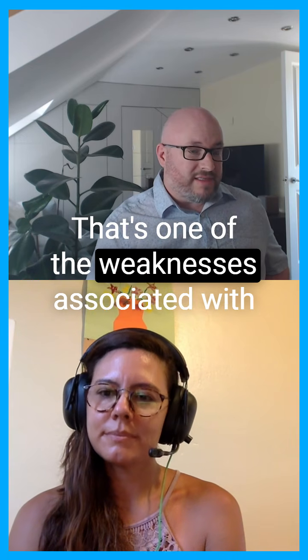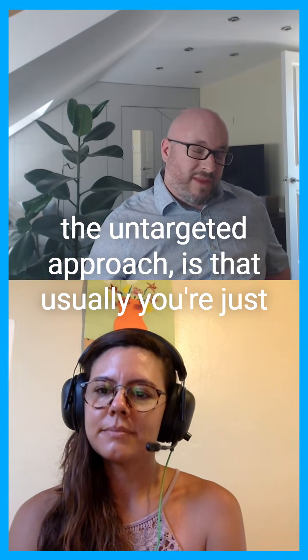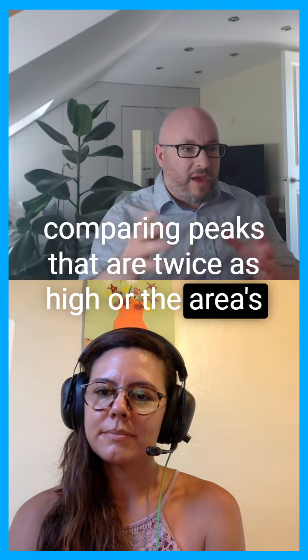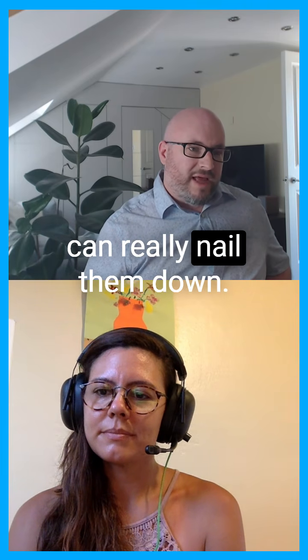That's one of the weaknesses associated with the untargeted approach, that usually you're just comparing peaks that are twice as high or the areas twice as great as the other peak. But in targeted analyses, you can really nail them down.